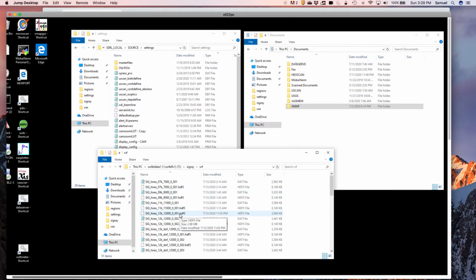The last thing I'm going to mention here then is when we look at our XRF files, you will generally find that you have 2 files for every file name. You're automatically appending a file that has your base name with an energy. That's the energy that the data file was collected at, and an index of 1, 2, 3, 4, or 5 to prevent overwriting. You will find that there is an HDF file and a DAT file. The DAT file is a plain text ASCII that you can read fairly easily and parse yourself. And the HDF5 is the binary data file that we typically use most often.